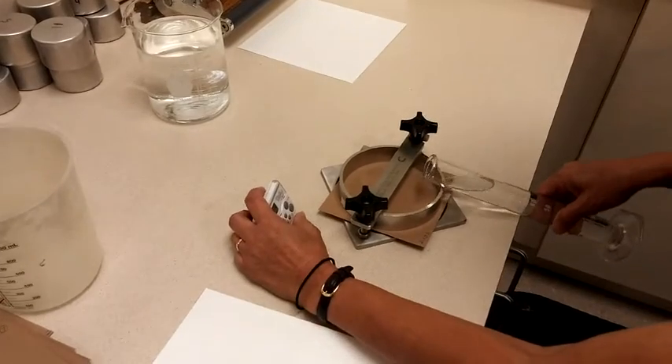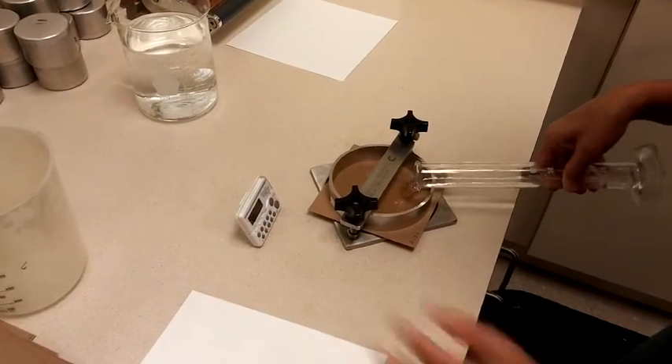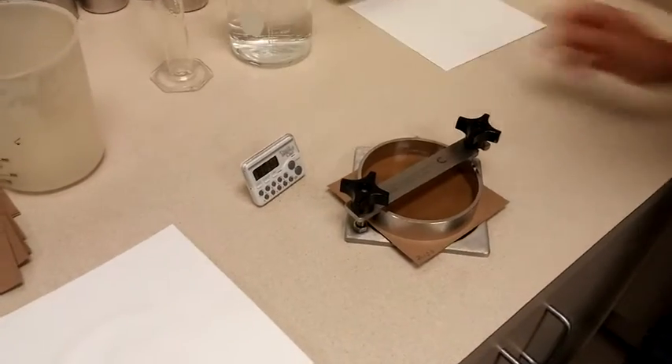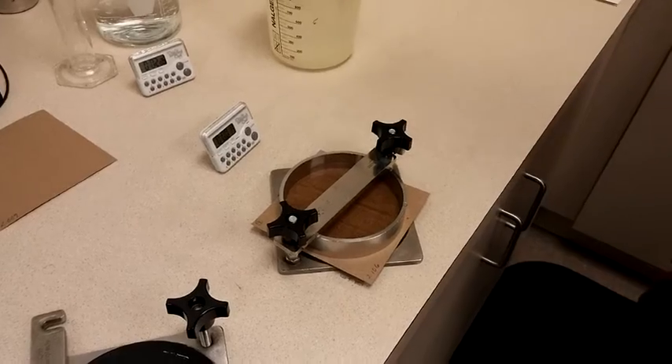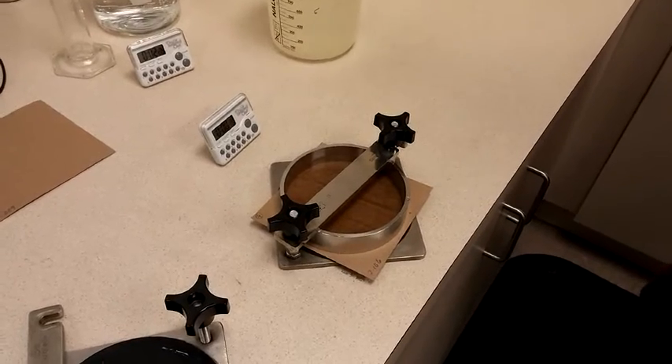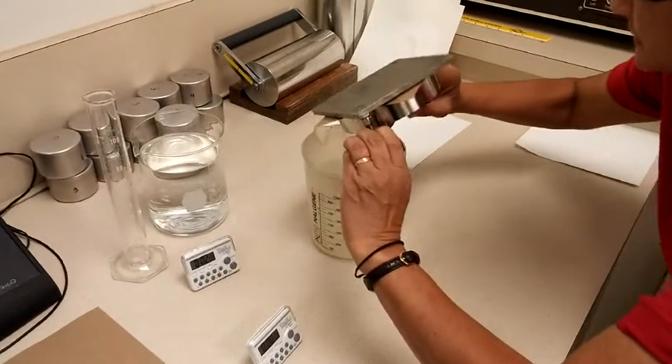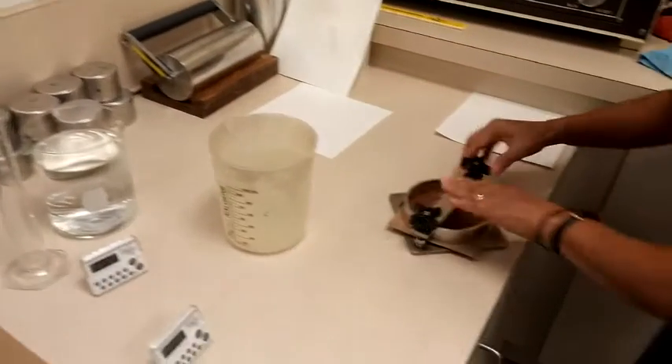The test run from the back side measures the base sheet sizing. The test run from the coated side responds to the openness or absorptivity of the coating. The test is run by placing a column of water on the paper for 2 minutes and measuring the amount of water absorbed.